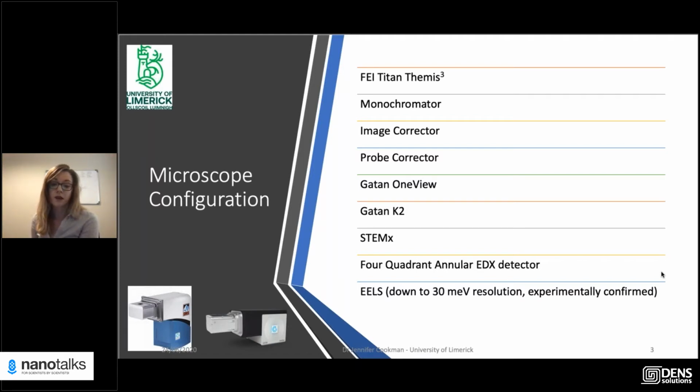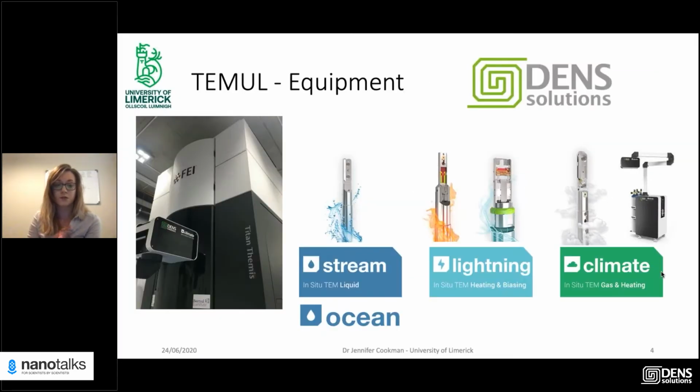We also have the STEMX and also an annular EDX detector rather than the side entry port one. And we have other spectroscopy solutions on it as well. So it's a great instrument, but really what makes that instrument so special is the peripheral equipment that we have surrounding it. So we do have a suite of Denssolutions holders.